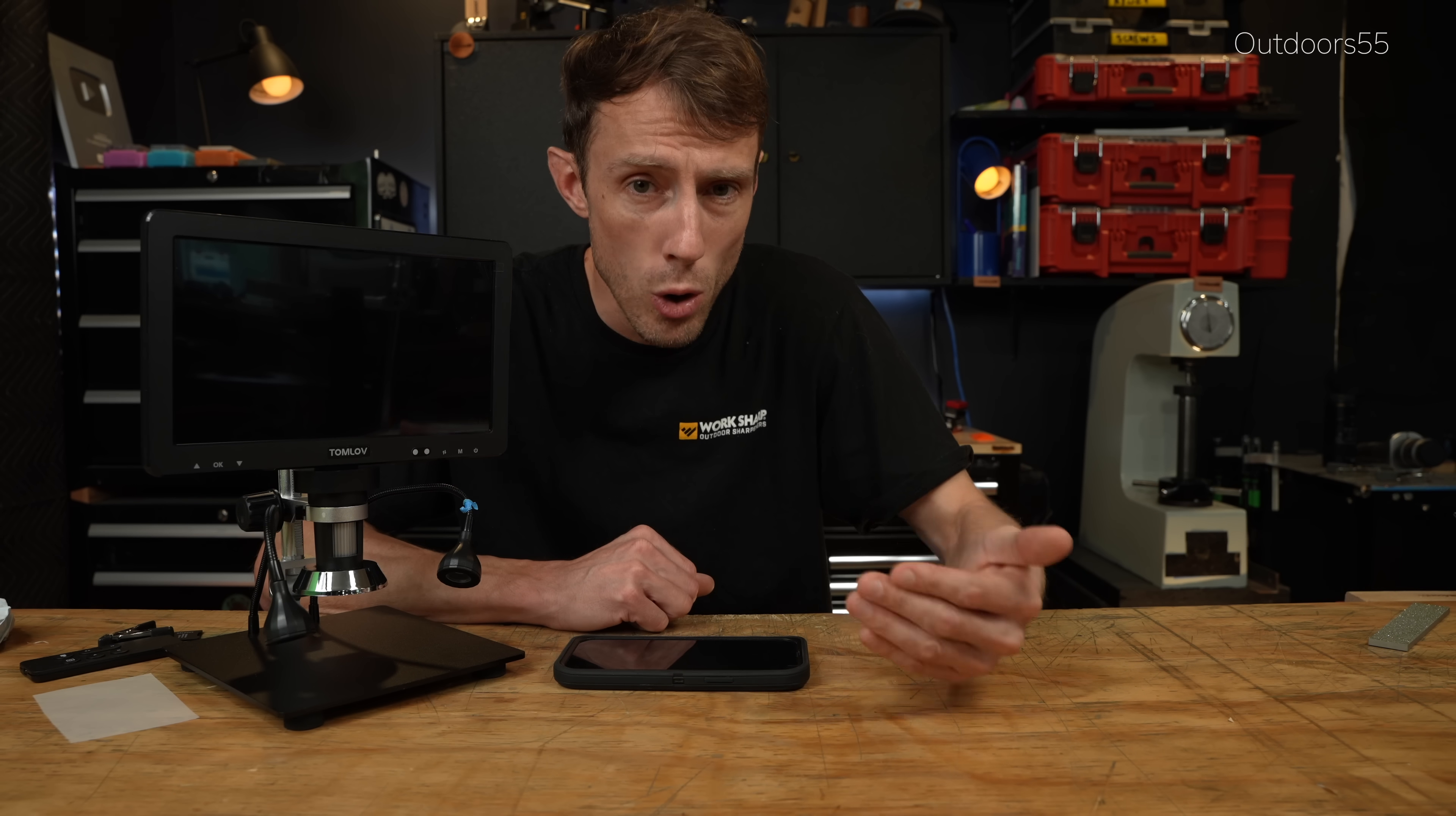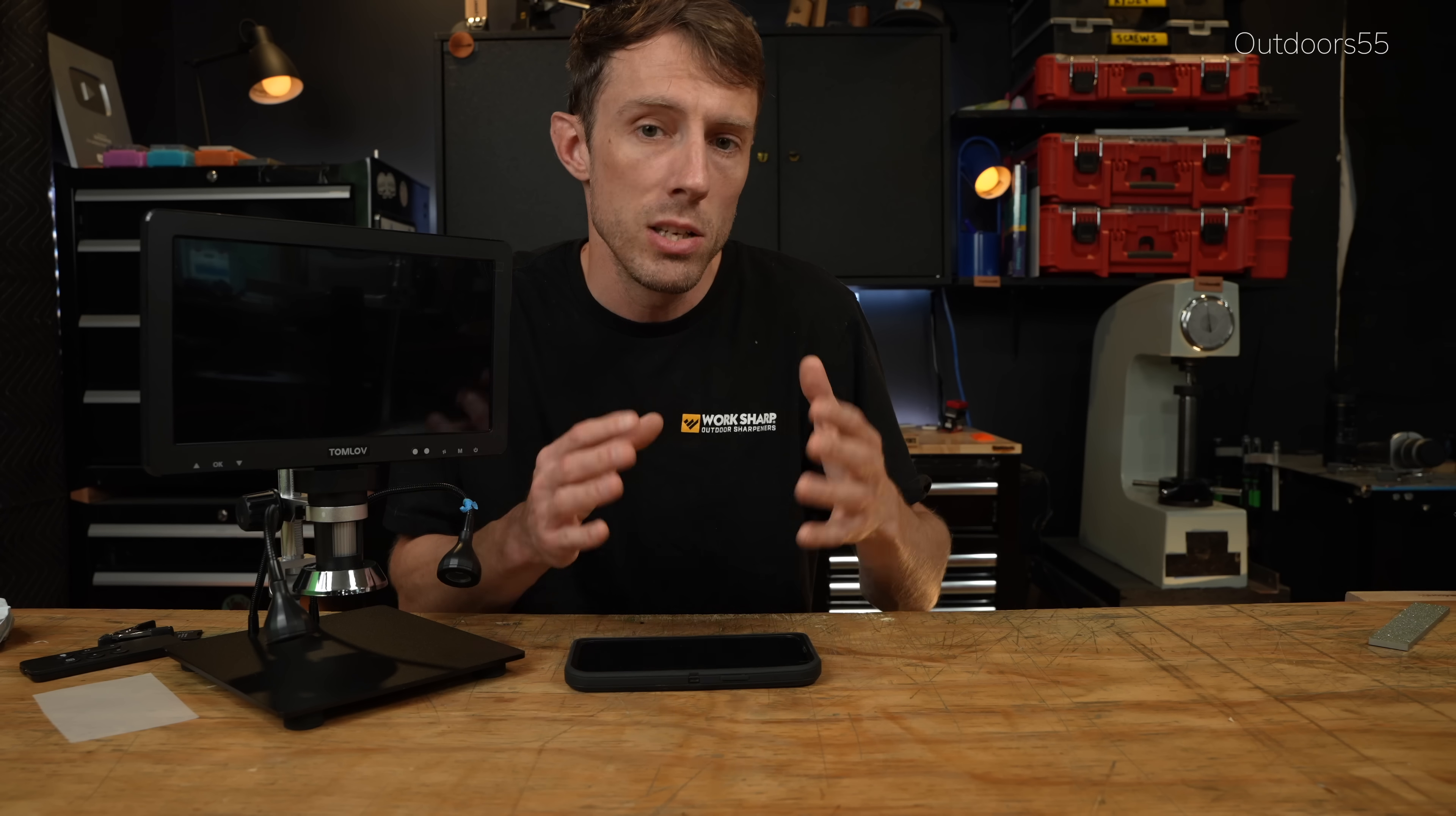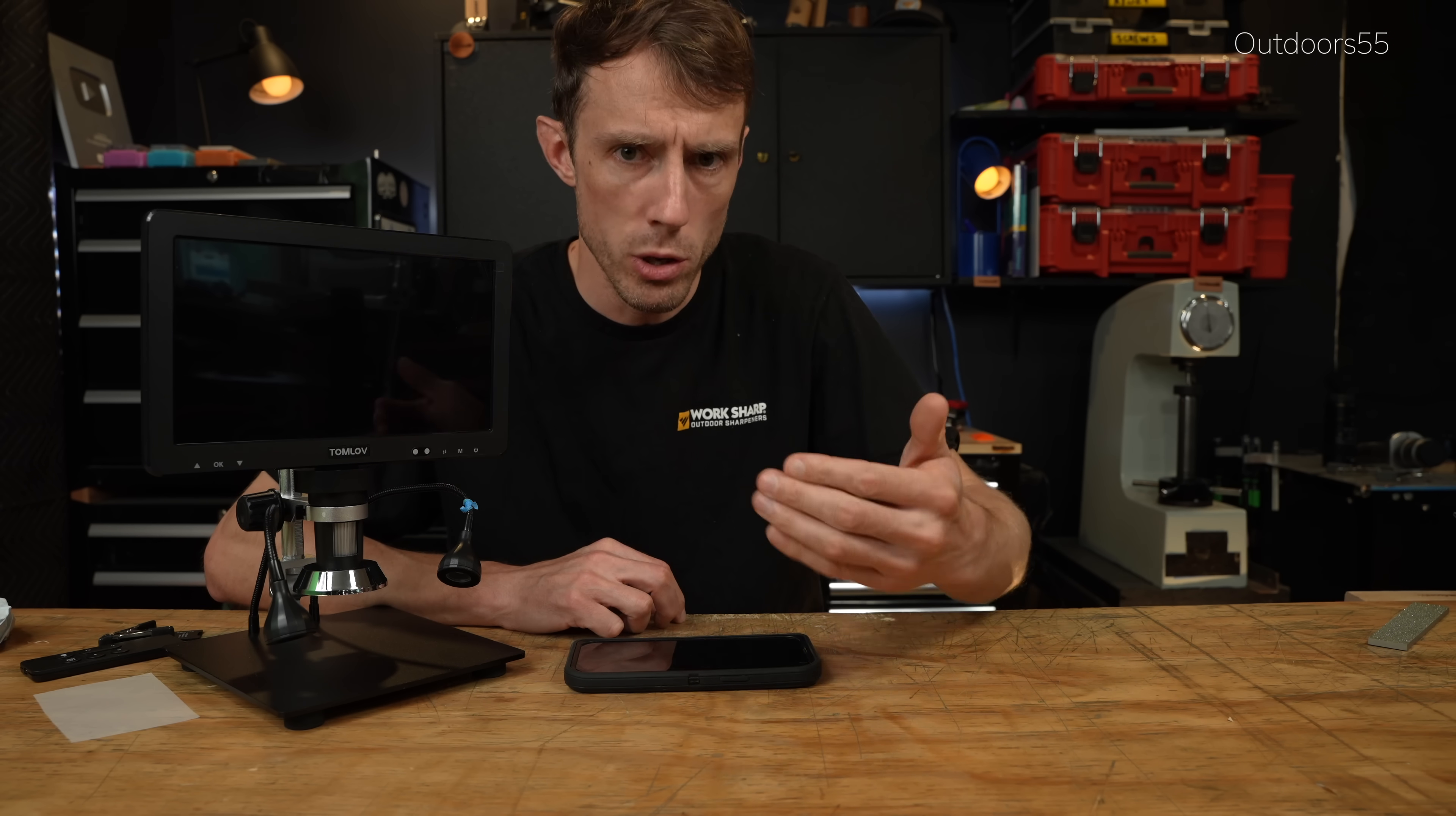Now, what this means for you, the viewer at home, watching this and looking at these up close pictures is that exactly what you're viewing these images on, whether it's a phone or a giant TV mounted to the wall, or maybe an iPad, a screen like this, that's going to affect the ultimate magnification ratio, as well as the exact resolution of the screen that you're viewing on and the resolution of the actual video that you're watching, which is most likely 4K. Now, for me, sitting at my computer at home, I have access to the entire, in this case, 24 megapixel image on my computer, or if I'm using another camera, the entire 63 megapixel file size, which means that I actually can get a higher magnification with more resolution sitting at my house than I can actually share with you sitting at your house, unless we crop into the picture. Cropping allows us to use the camera's resolution to zoom into the picture even more, which even further complicates the exact magnification ratio that we're actually using, or what you are actually seeing sitting at home.